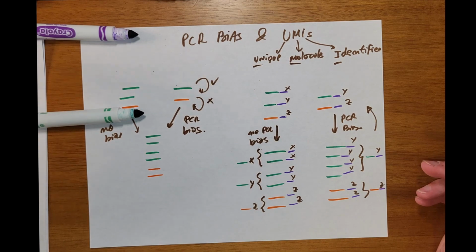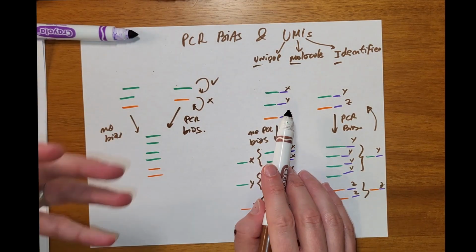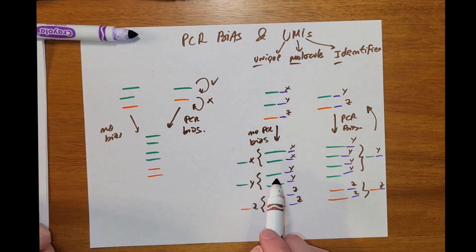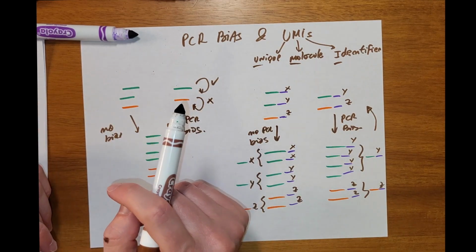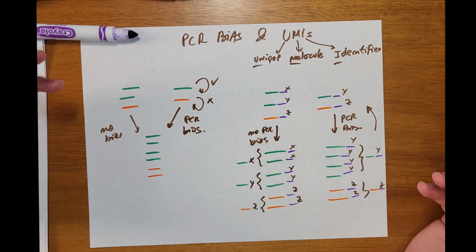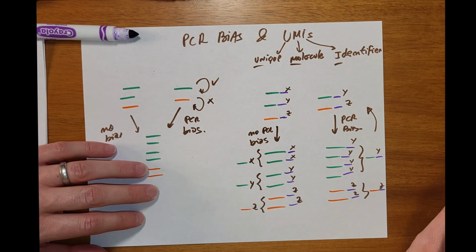So the important thing here is to attach these molecules with the unique identifier before any PCR amplification, which can be tricky, and probably the best way is to do this by ligating physically the 2 molecules. Sometimes you cannot do that. People do a first round of cDNA, although that has some problems because there can be some lagging primer in the mix.